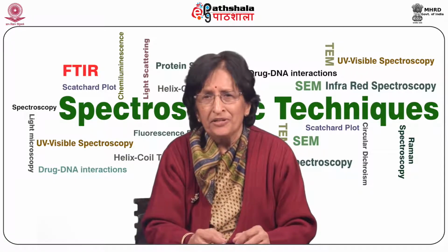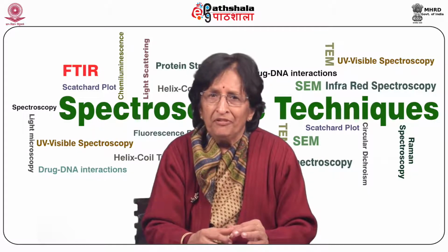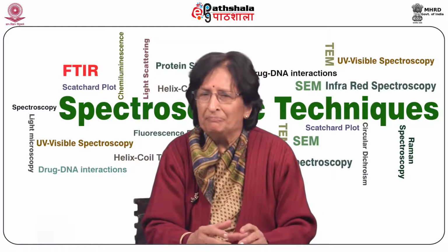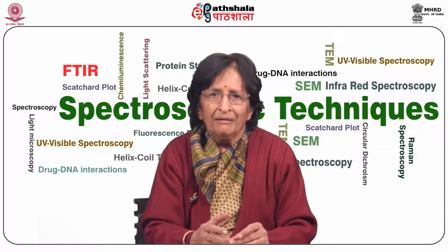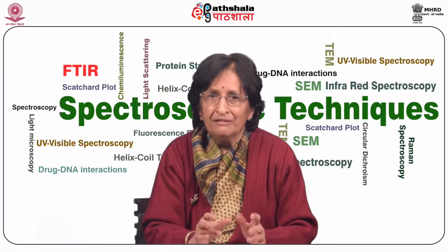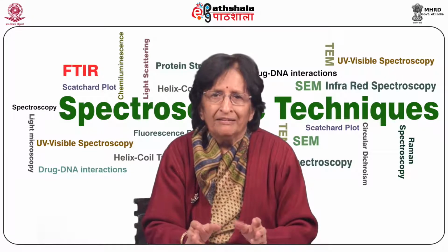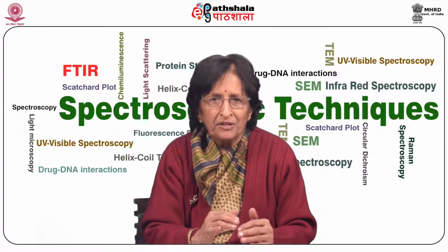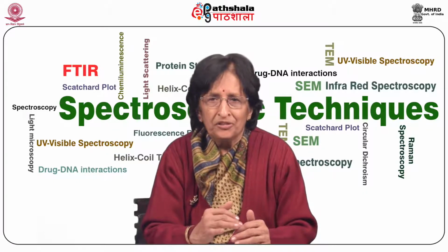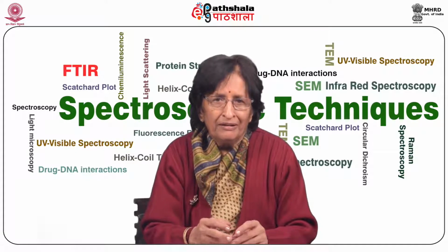Performing absorption measurement on DNA, what we actually do is measure the absorbance. Basically, we want to measure only at 260 nanometers. But one should use such a dilution that you get measurements where the absorption goes linearly, generally between 0.1 to 1 OD.